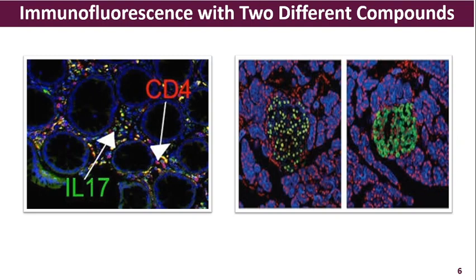one needs to have secondary antibodies which are tagged with two different immunofluorescent dyes. Say for example, one secondary antibody meant for IL-17, as shown in the figure, is conjugated to fluorescein isothiocyanate, and the other secondary antibody is conjugated to rhodamine.